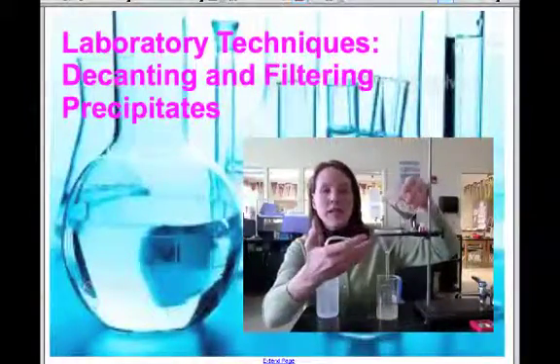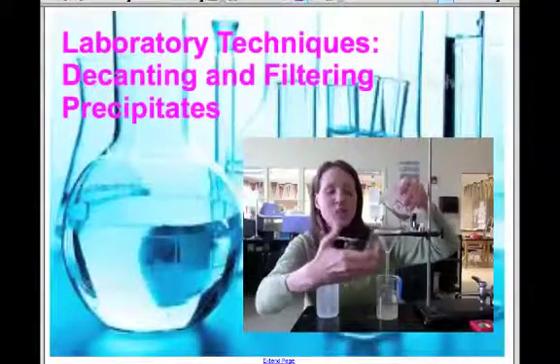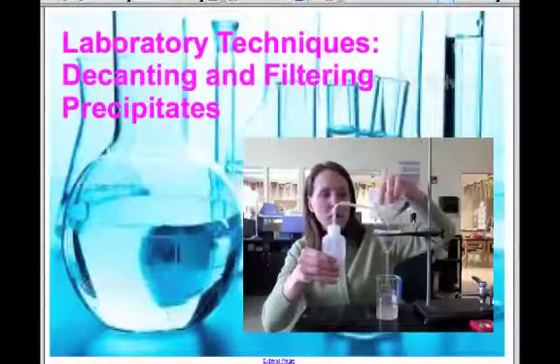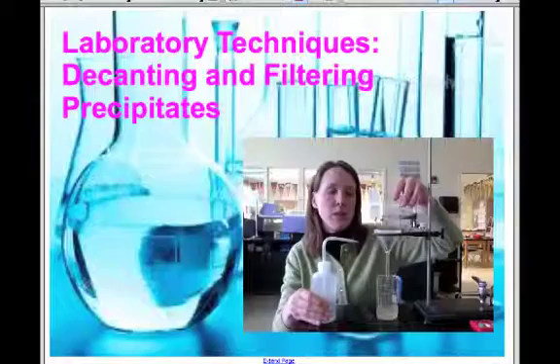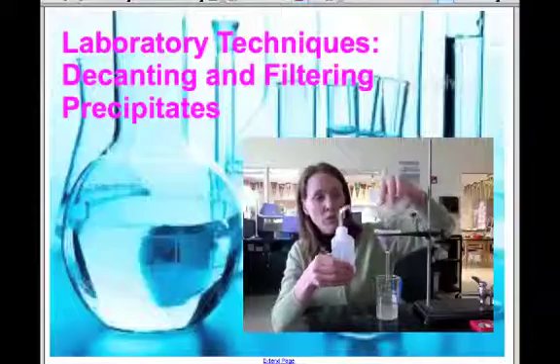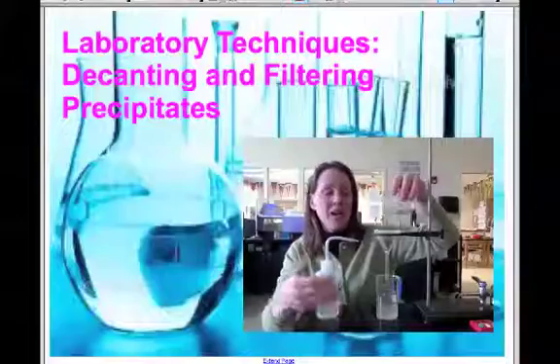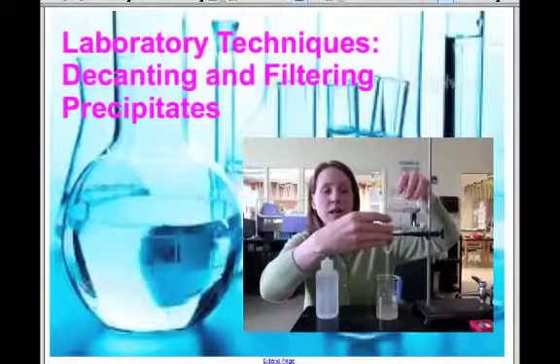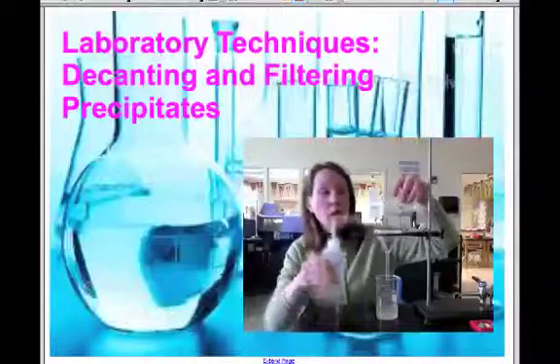And you can see that it takes a long time for the liquid to come through the filter paper. So as much as you can do without having to put as much deionized water in is beneficial just for the time's sake. But eventually, as you can see, I'll be able to get all of the precipitate into my filter, okay? And then once the liquid has come all the way through the filter, I can then remove the filter paper and lay it out to dry and then weigh my product.